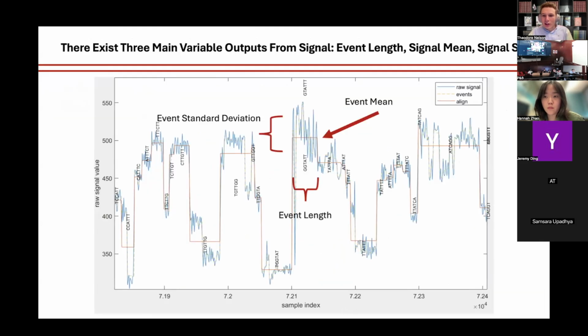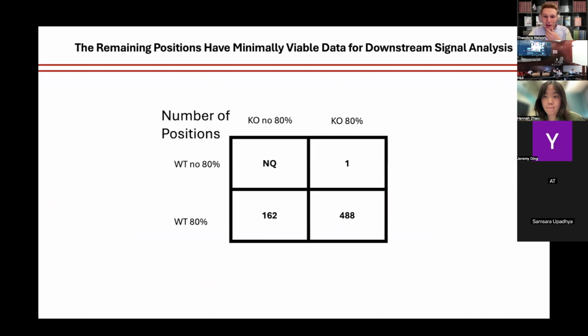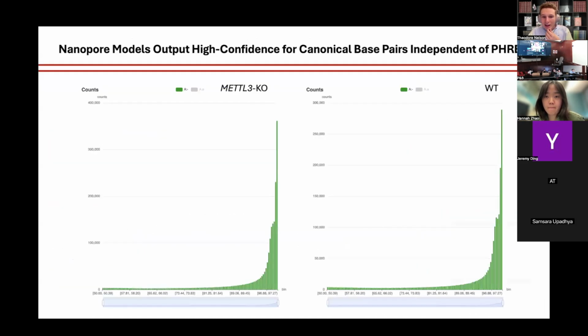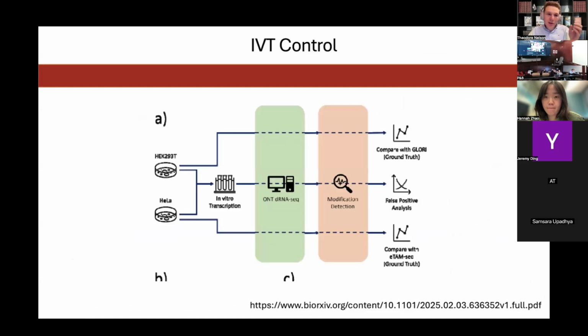And I guess I should have put in the slides that show this phenomenon better. I might add these when I send these slides out because I think it's a very good demonstration. But we took two technical replicates, where the same dish was split, RNA was extracted, and then these were compared. If you look at m6A, a lot of the sites are shared, as you would expect, at the same stoichiometries.